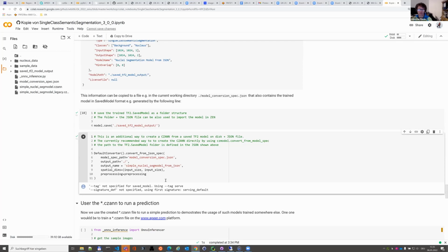By itself, obviously ONNX, TensorFlow, and so on and so forth, I don't see a reason why it should not work in the bioimage model spec. So what we could think about, and this is also an invitation to some of you, this is open, we could create other converters, convert to bioimage, whatever. Why not? But right now, I think it will not work out of the box.